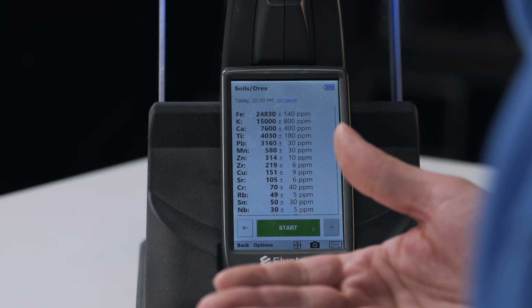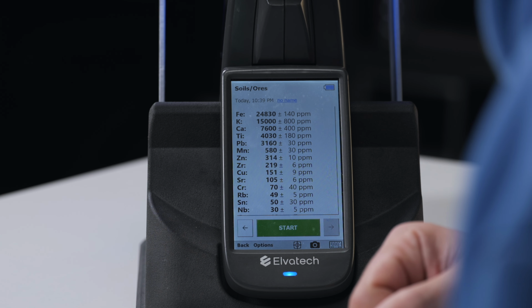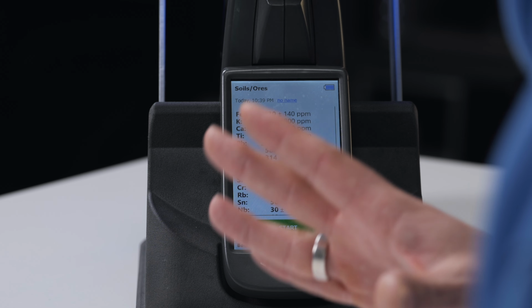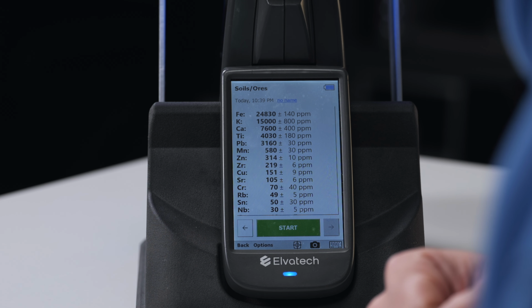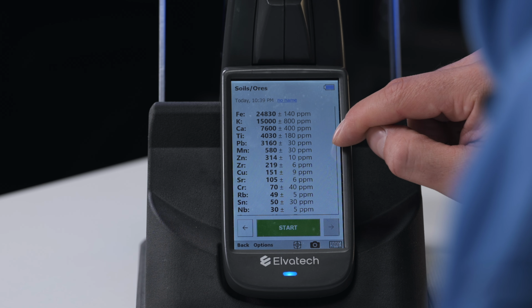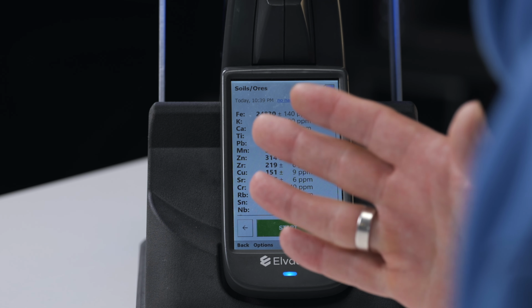The next one we have is manganese in the amount of 580 ppms. And the next one is zinc, which is also not that good. But the contamination of it is pretty small. We have 314. All other elements, I can just mention them a bit, but here we have really a lot. In this particular sample, we have really a lot of different elements.